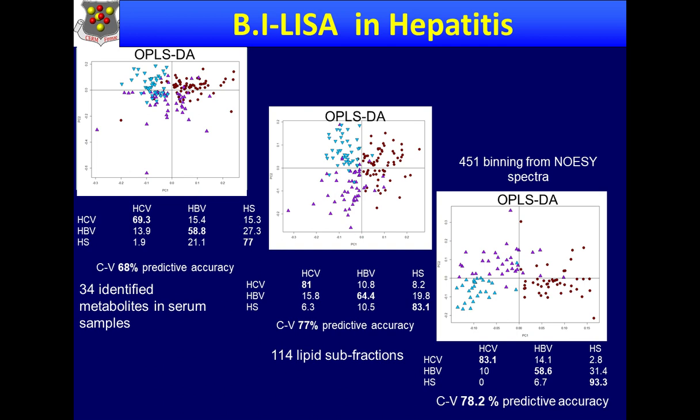Whereas if you go to the lower right, you see the predictive accuracy by binning, by our standard fingerprint method. It's 78.2, which is significantly better. Then what is very interesting for us now in this webinar is that if you use the lipid subfractions, which is 114 different variables, you see that the discrimination is almost as good, or practically identical to what we get from binning, which means to us that what we are capturing from the noisy spectra is probably mostly the broad signals, the lipid components, which are clearly identified, and of course with all the extra information that you get from having identified them.